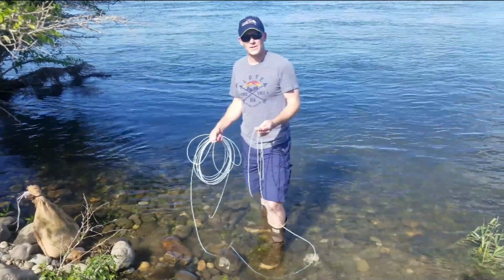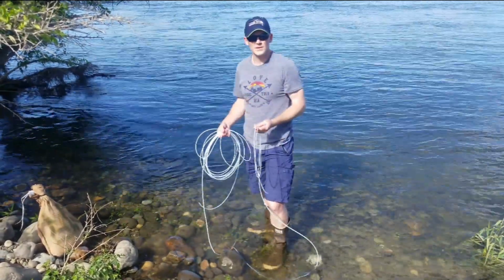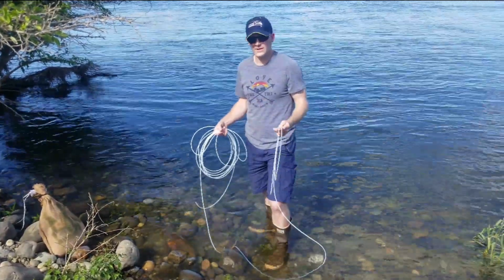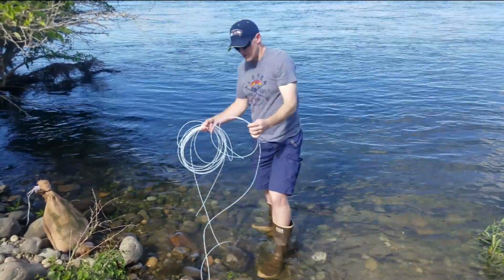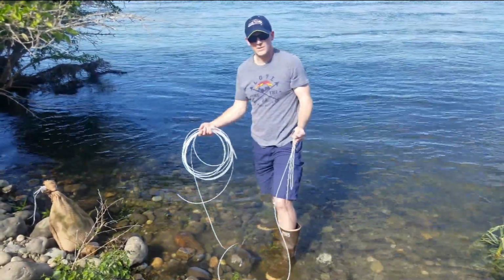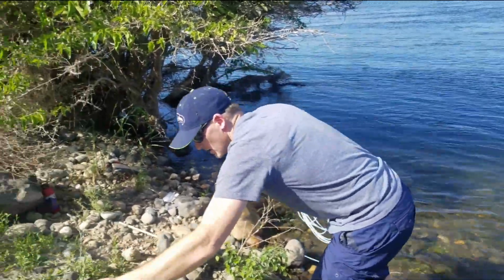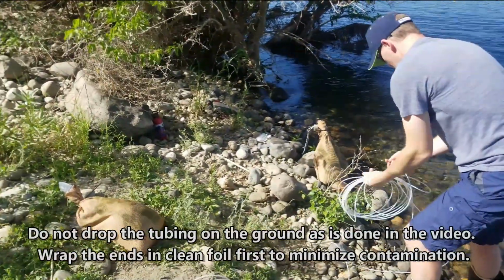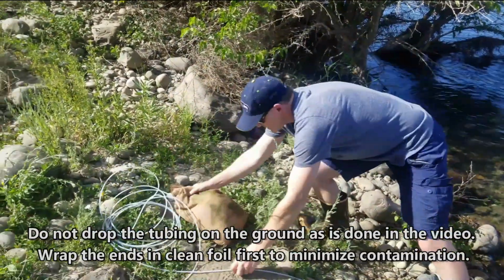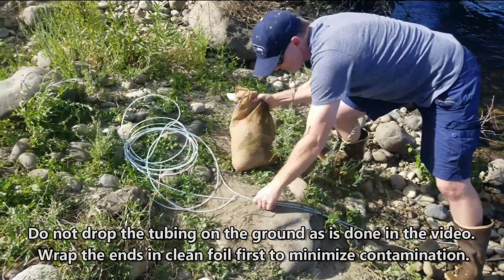After you've got your surface water tube zip tied onto your middle push point, then you're going to run your tubing up the bank to a location that will be above the water during the whole time course of the study. Also make sure you keep track of which tube is going to your push point and which tube is going to your surface water. You run it up the bank, and then temporarily secure it with a sandbag that we'll provide.